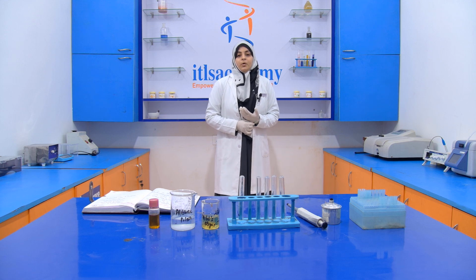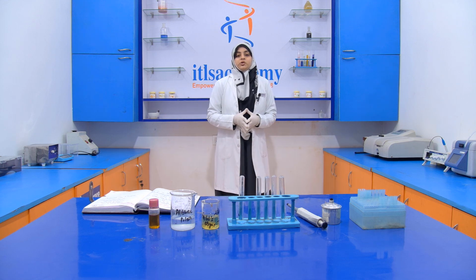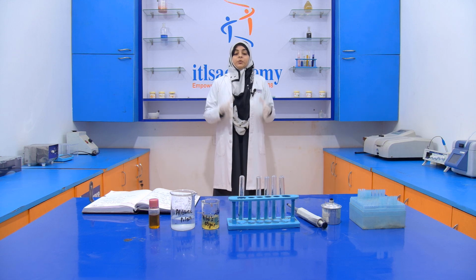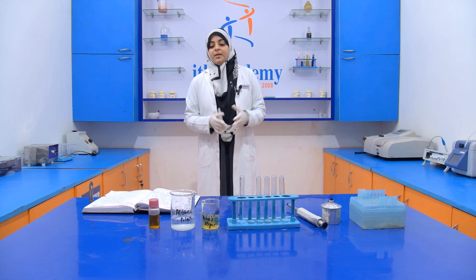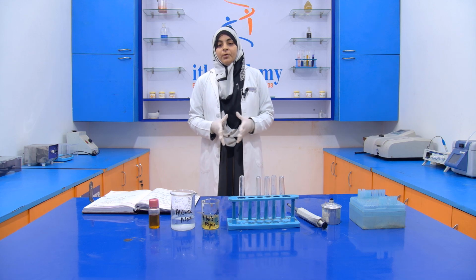Today we are going to discuss another experiment, that is the detection of the adulterant in an edible oil. Today the experiment that we are going to perform is the detection of mobile or lube oil in an edible oil.